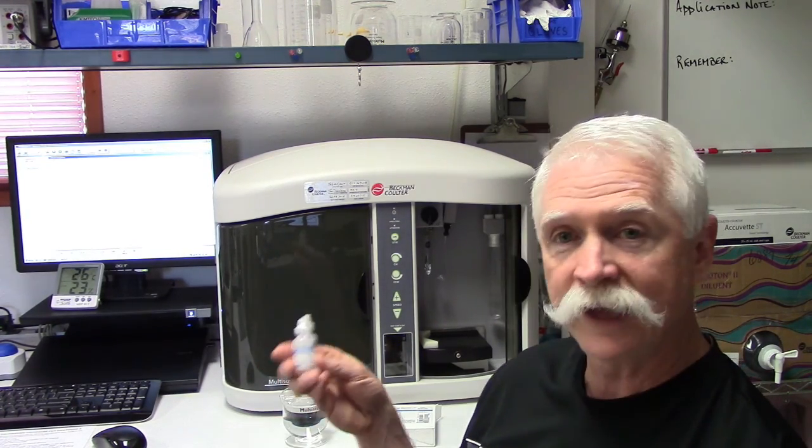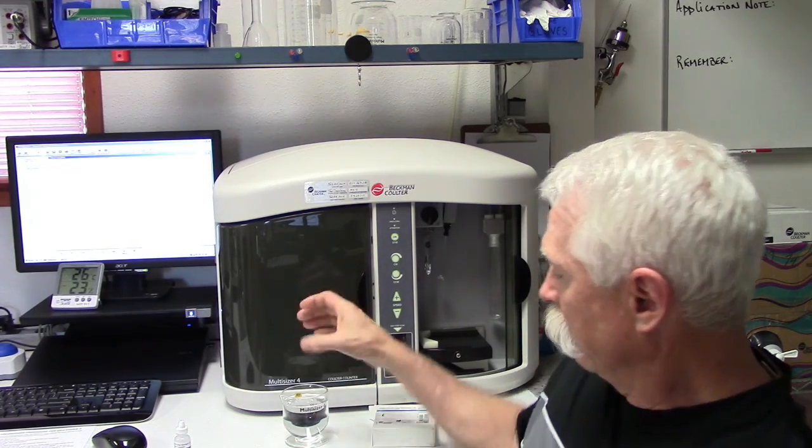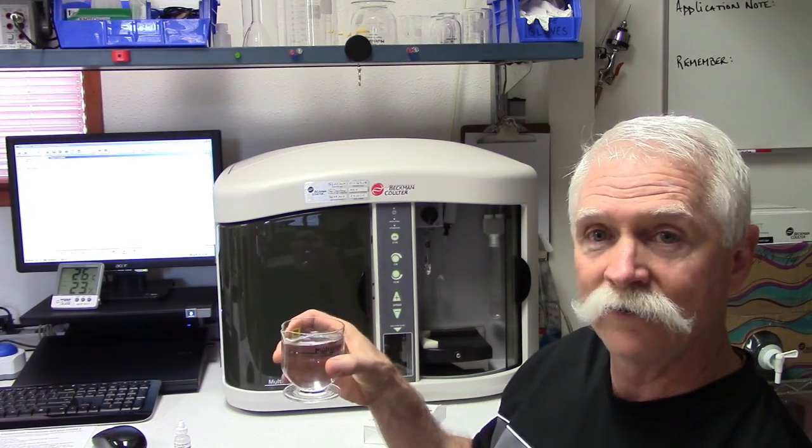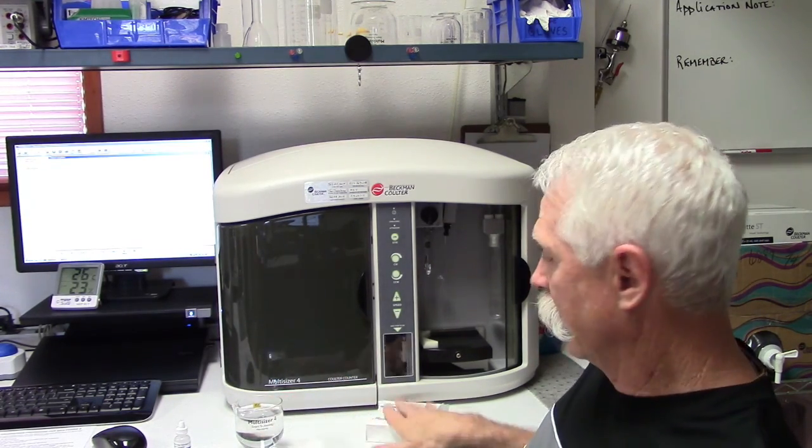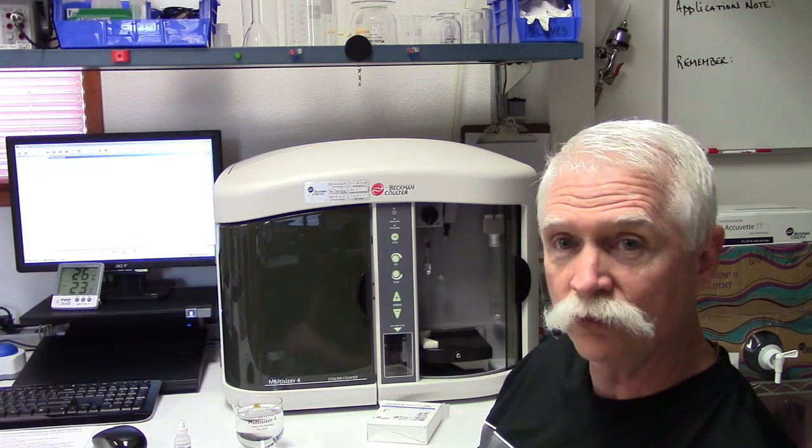You're going to need your L10, which is your 10 micron control standard. You're going to need about 200 milliliters of clean Isoton 2, just like we specified in the SOM. Of course then you've got your assay sheet from your control standard.